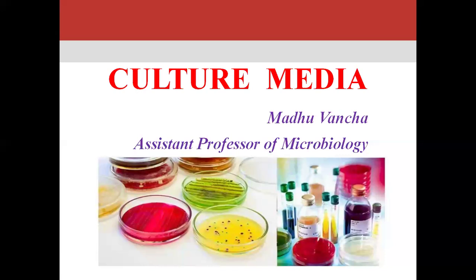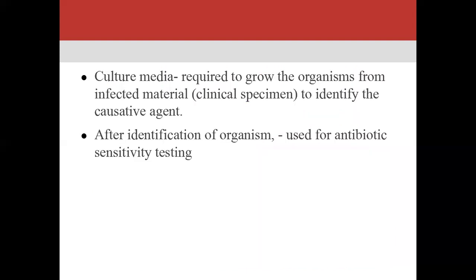In this session, we'll discuss one of the important topics, that is culture media. So what is culture media? Culture media consists of all the nutrients which are essential for the growth of bacteria and fungi. Culture media is required to grow the organisms from infected material. Infected material is nothing but the clinical specimen, which we collect from the patient to identify the organisms.